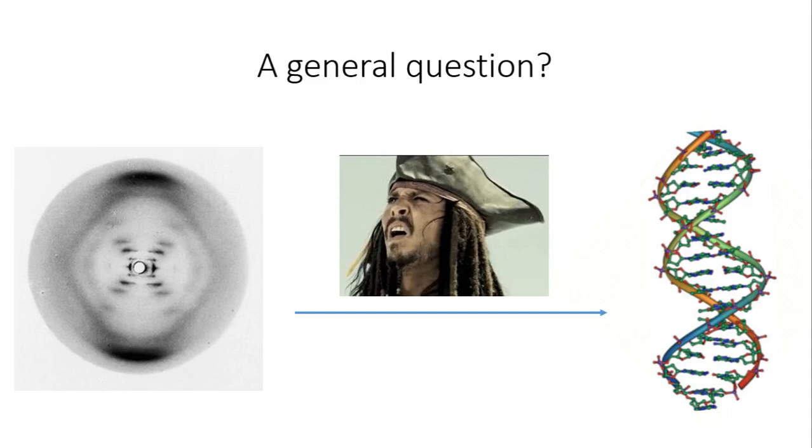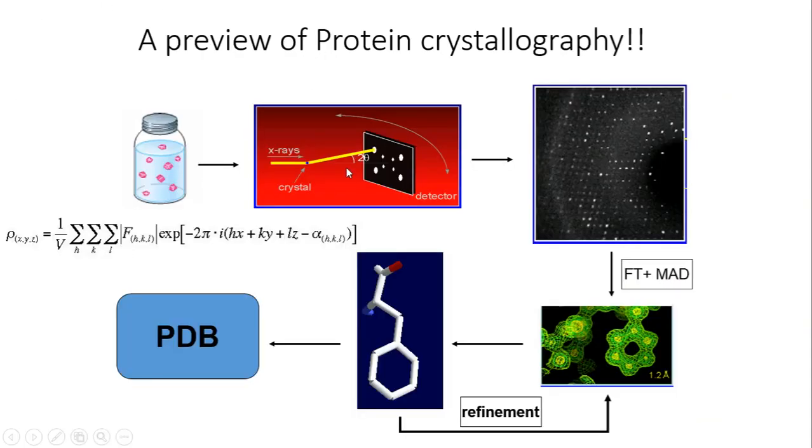To begin with, we would have a brief preview of the method called protein crystallography. Let us first try to understand what protein crystallography is.